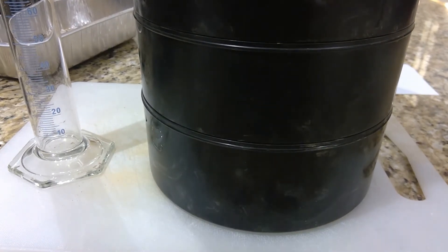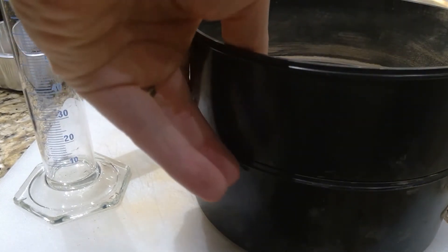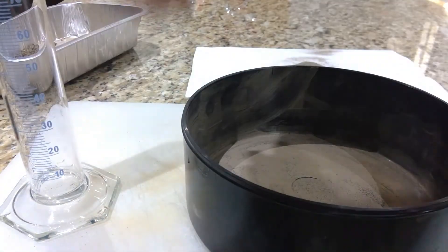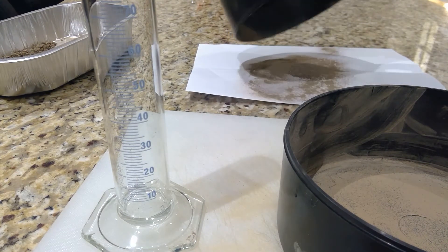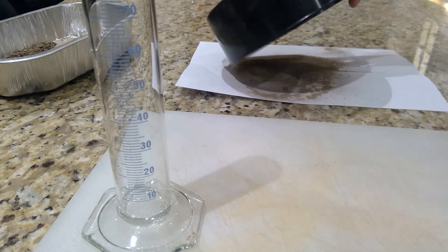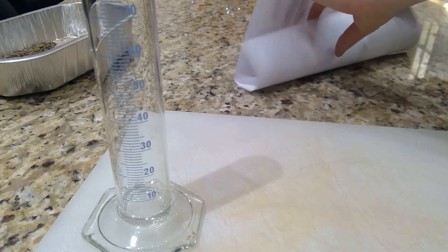I'm just going to take you for a look inside the top layer — there's nothing left in here. I'm going to take each tray; I have the sand already done. You can see the silt here — I'm going to tip this out onto my sheet — and then my clay at the bottom. I do this to make sure I have a large enough sample to fit into my graduated cylinder.